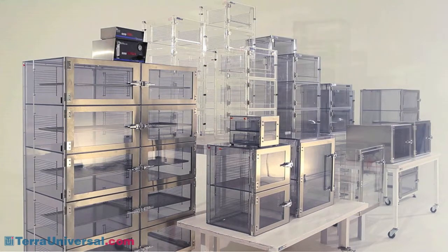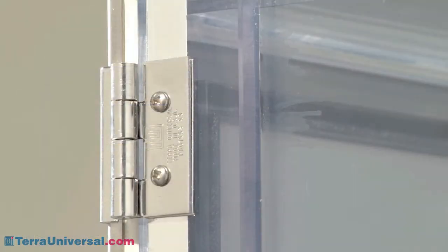This material has a slight blue tint, making it easy to distinguish from acrylic. All stainless steel hinges stand up to years of heavy use without sagging.